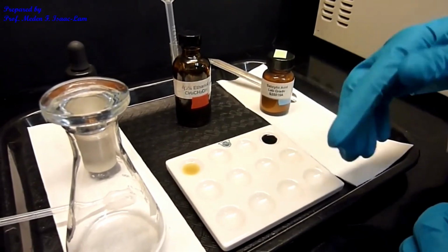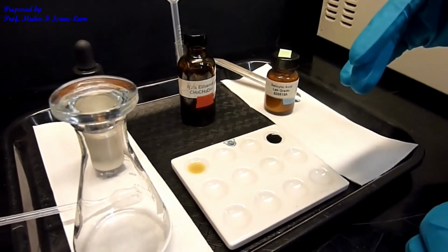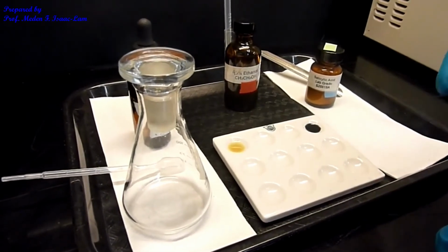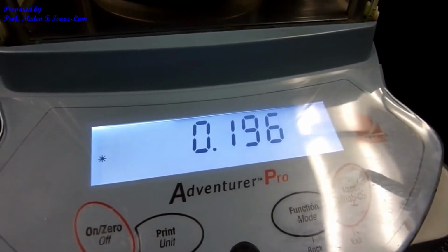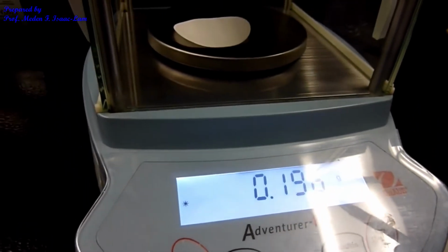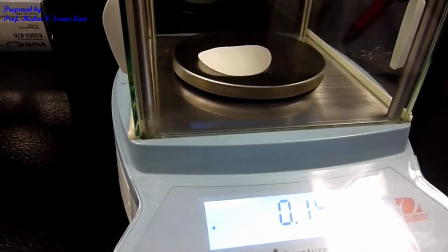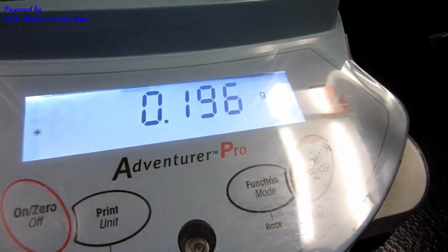So that means that the salicylic acid was now converted into the aspirin. That's the test for the reaction that it already is completed. We are going to do vacuum filtration later. So again, we have a filter paper inside the balance, and the weight of the filter paper is 0.196 grams.